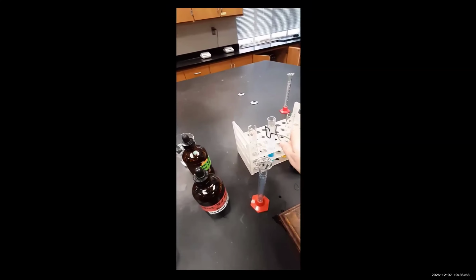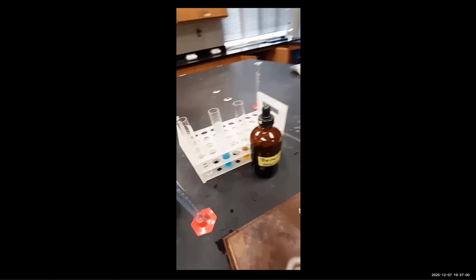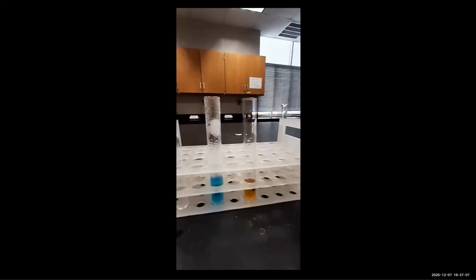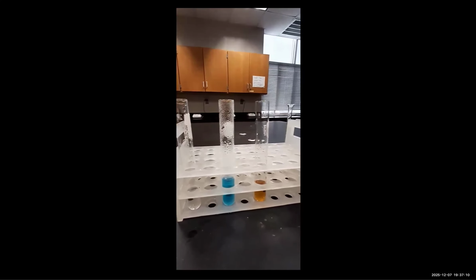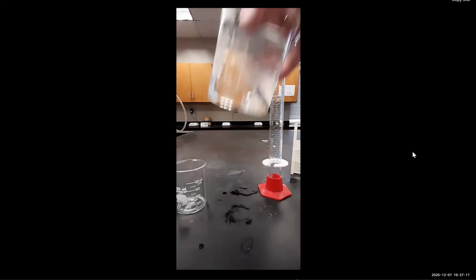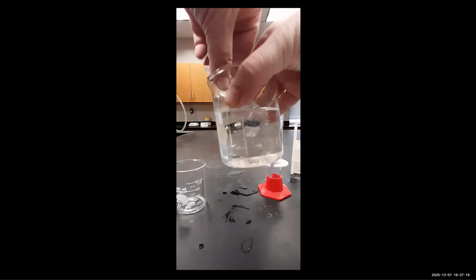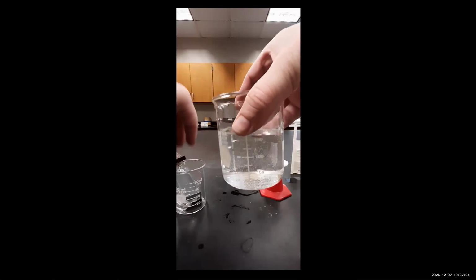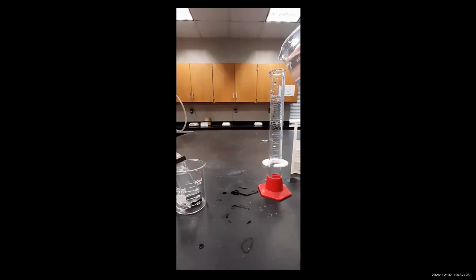At this point, the dialysis has been running for a fair amount of time. So let's check up on the results of dialysis. So 30 minutes later, we're now going to test the water in the beaker, and we're also going to test the water inside the dialysis bag. We're going to start by testing the water inside the beaker first and foremost.